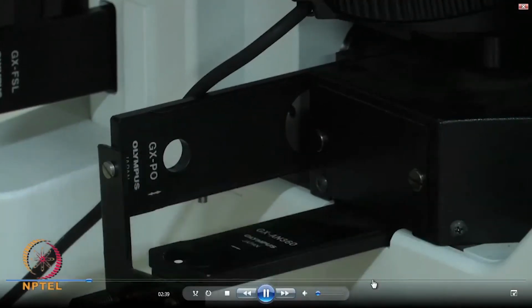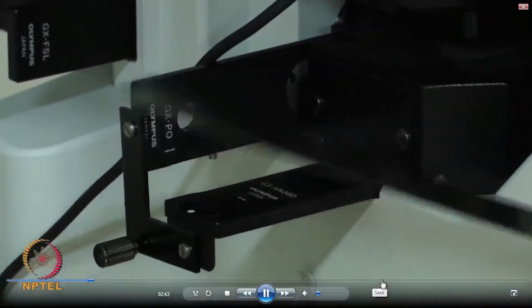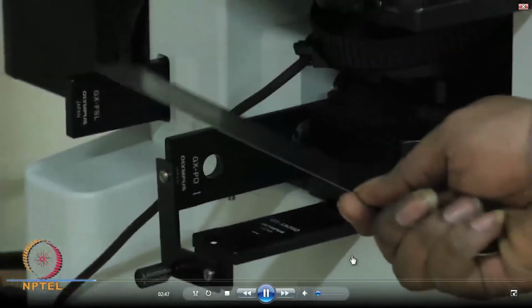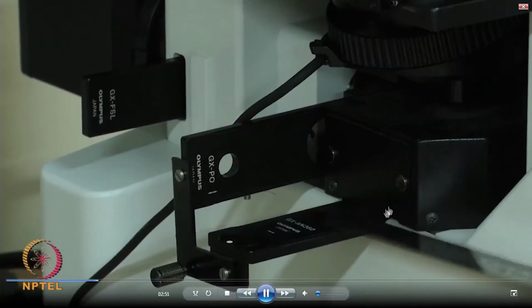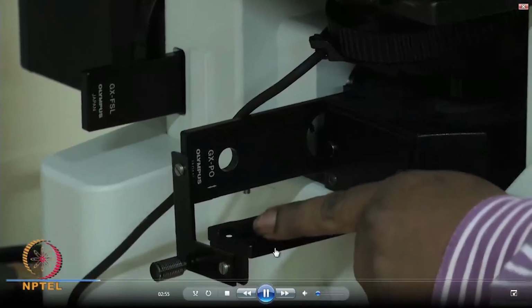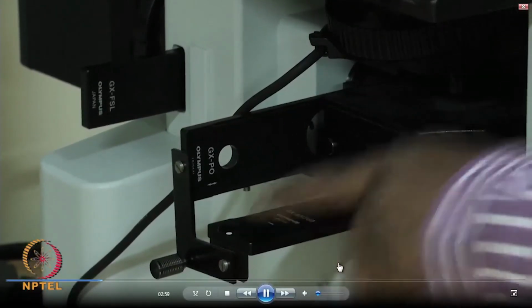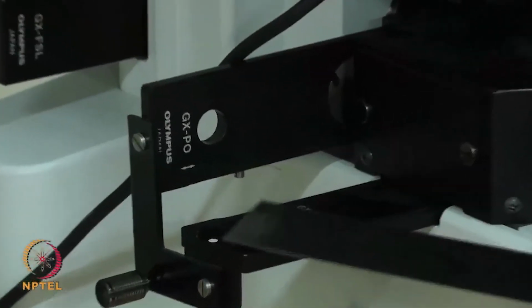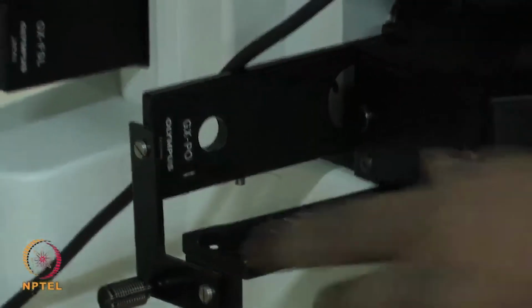The polarizer and analyzer are kept in two perpendicular directions, and now we will see how this is going to change the contrast of the microstructure. Now we are seeing that knob being moved to appreciate the orientation of the analyzer.